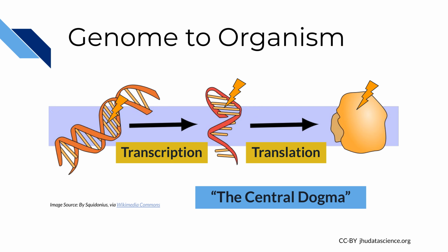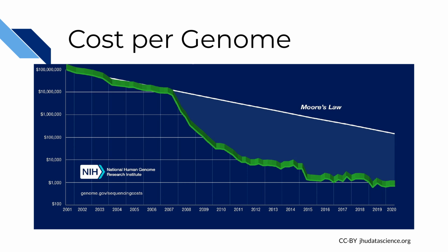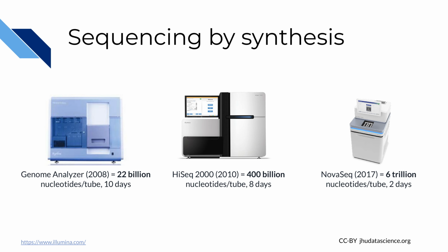Affordable DNA sequencing helped researchers catch the genetic differences in coronavirus quickly. The price to sequence a genome has dropped even more than expected given the technological improvements. Today, researchers can sequence a whole genome for about $1,000. Part of the reason genomic sequencing has become so affordable is sequencing by synthesis. This technology is still commonly used today. Improvements are also constantly being made to this technology.